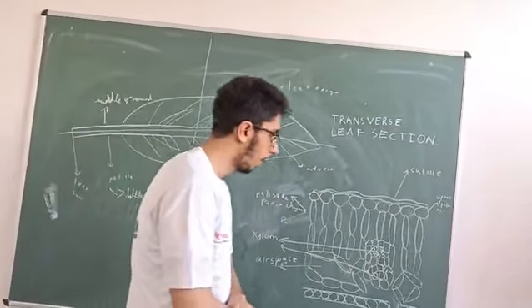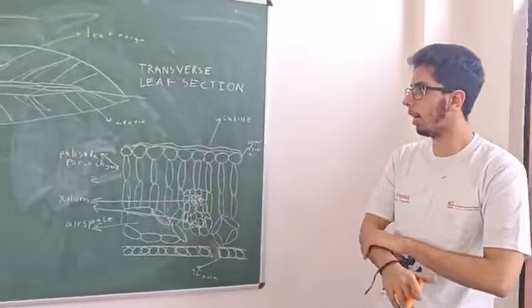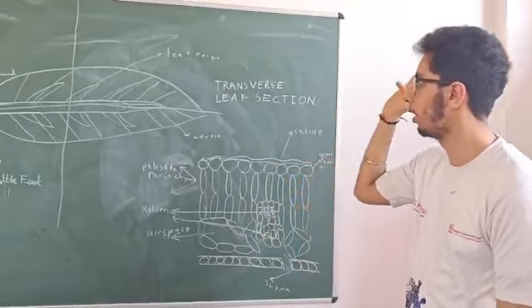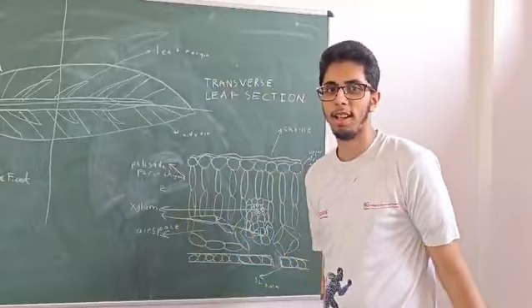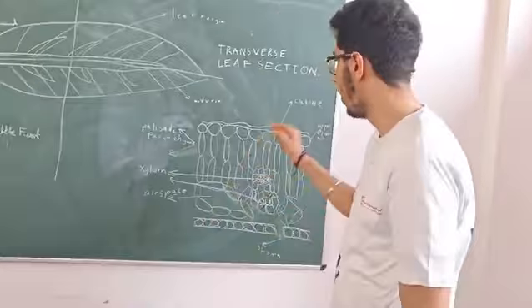So for now, consider an experiment that I'm doing. I'm using a transverse section, so I'm going to explain that. In a further video, I can explain how the longitudinal section looks, but right now I'm using the transverse section. So sorry if you guys wanted to see the longitudinal part, because I'll do it in another video, don't worry.